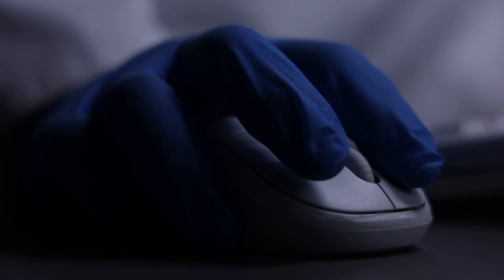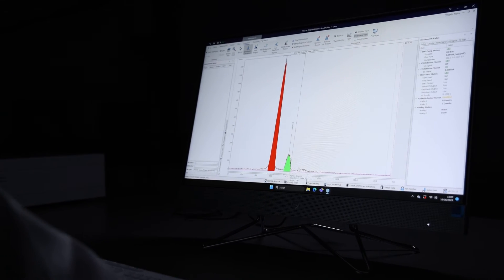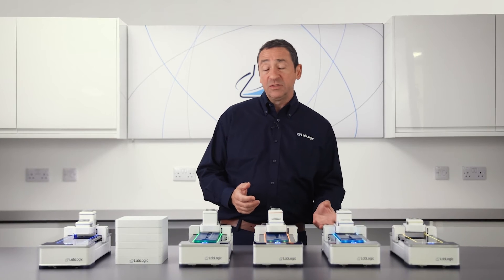All ScanRAM models are controlled by LabLogic's market-leading software Laura, which is used in hundreds of radio pharmacies worldwide. It's simple, easy to use, and has all the features required for regulatory compliance.